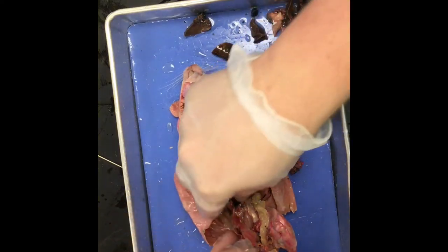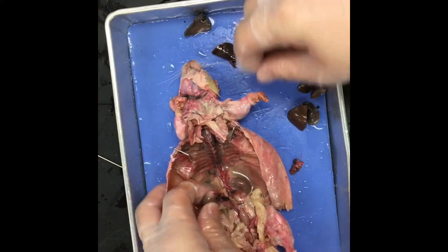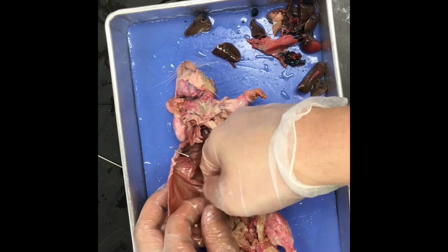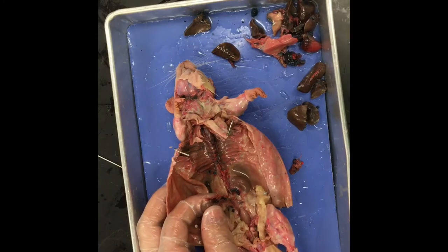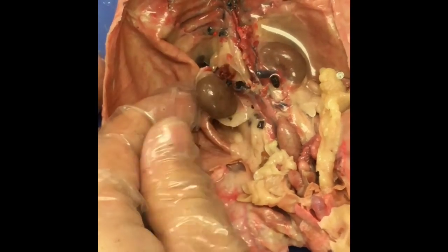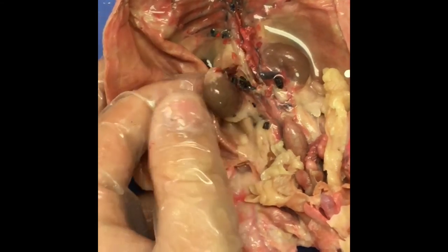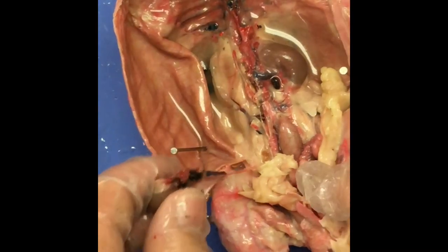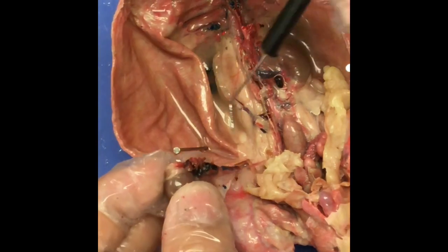All right, so the kidney, as you remove it, see if we can see it. It's a little hard. It looks like a bean. It's covered up quite a bit, but let me see if I can zoom in a little bit. There's the kidney. You can see the ureter coming off of that a little bit. The ureter is the tube that leads from the kidney to the bladder, to get the urine. That little one still connecting it, that's the ureter.